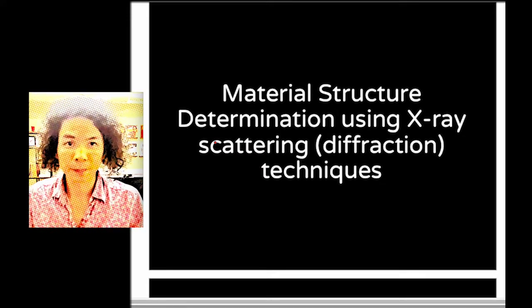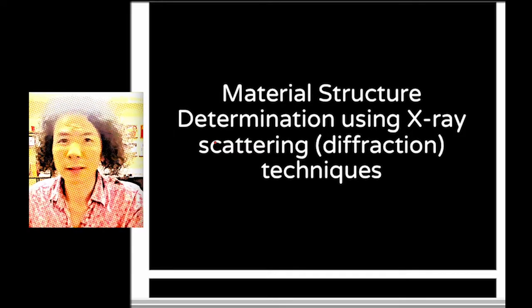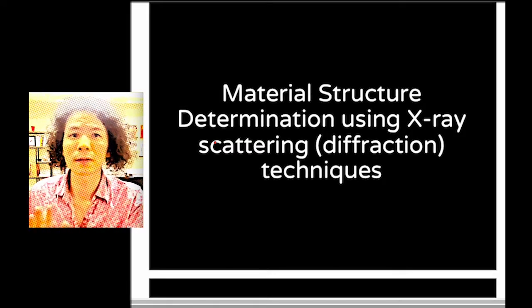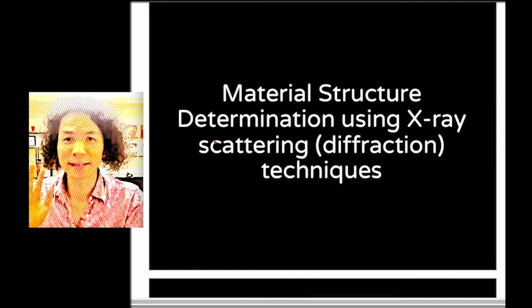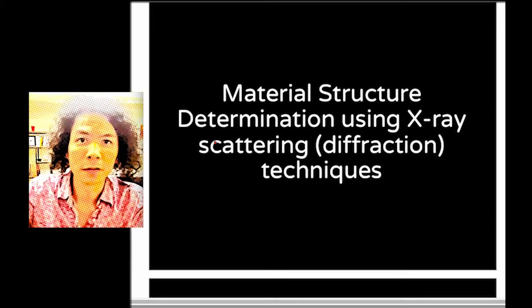do actually the material structure determination. It's pretty easy. All software you need is just Excel, Microsoft Excel. So you should be able to do it by yourself.